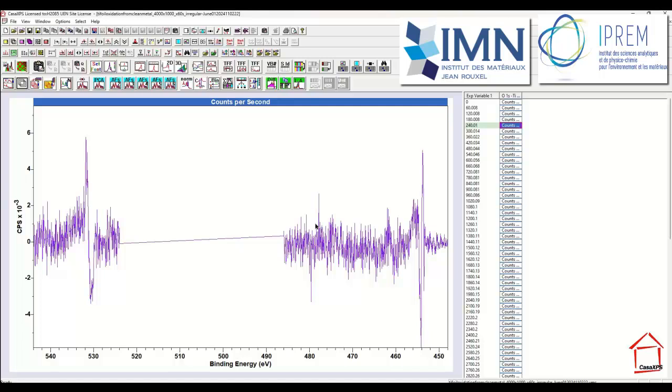And this is important when we come to do difference calculations, because when you do a difference calculation, the difference between noisy data is amplifying the noise. So we really need to have the best quality data before we start performing difference calculations.